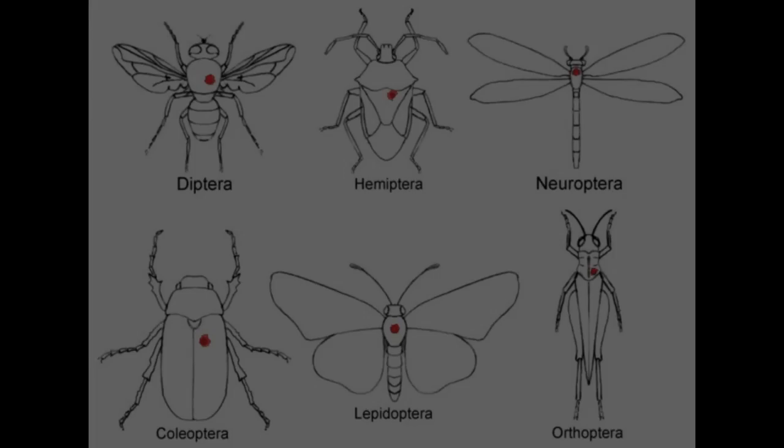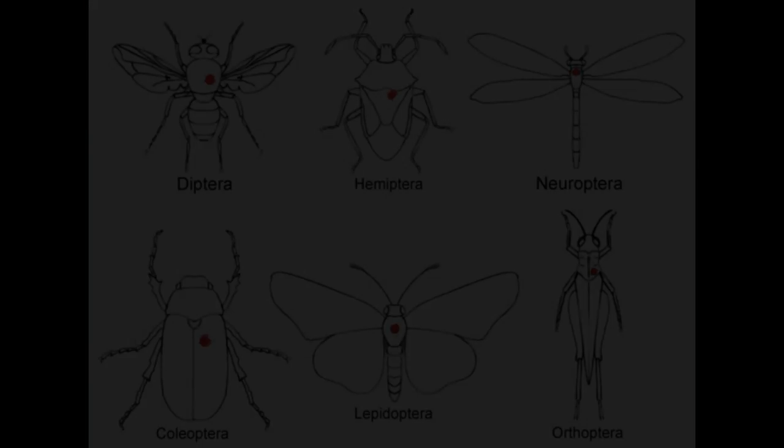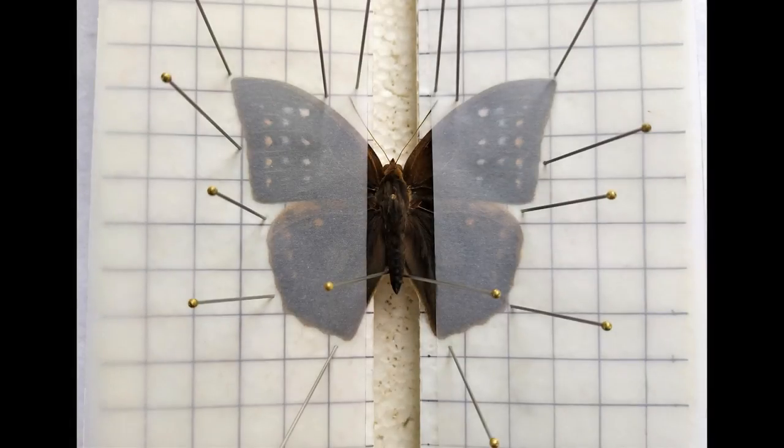Different groups of insects have different sites for pinning, as a general rule, as seen in this diagram. The red dots on each insect indicate the site where the insect pin has to go through for that particular order of insects. In this video, I'll be showing you how to pin and spread a butterfly specimen.